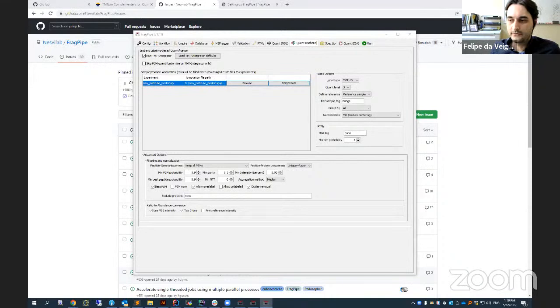They are usually good if you're doing explorative analysis and trying to identify new variants, or if you're looking for specific variants that can be only present in certain samples. By default, if you don't know if you need it, you probably don't need it. So I would start without the isoforms unless you really have a reason for looking for them.